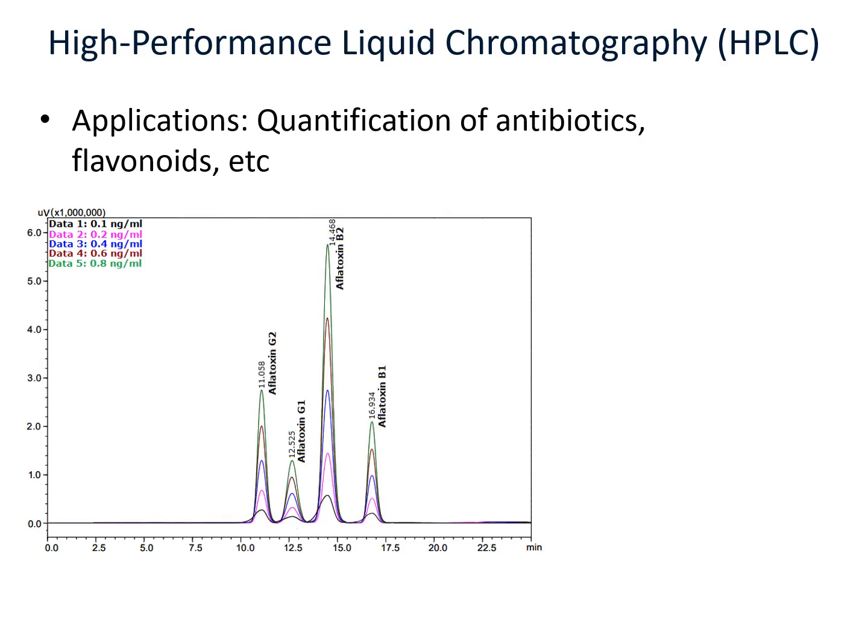Just like in thin layer chromatography, a standard or analyte is first analyzed using various solvent systems until a very good separation is achieved. So the analysis is carried out at various concentrations in order to have various peak areas for each concentration.